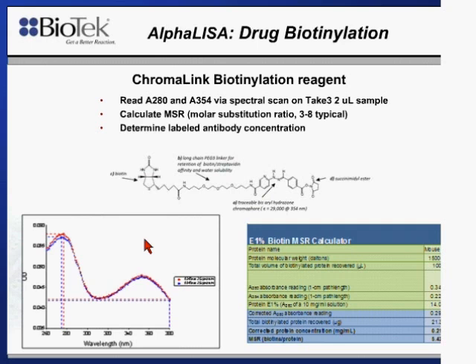And what we're looking for here is a typical ratio of about 3 to 8, and it might be hard for you all to see, but we ended up with a ratio of about 5.42 and corrected protein concentration of about 0.21 mg per mil. And this is enough to run a sufficient number of assay data points for what we're looking for. So this was a really quick, easy method to quantify not only our recovery as well as our labeling efficiency.